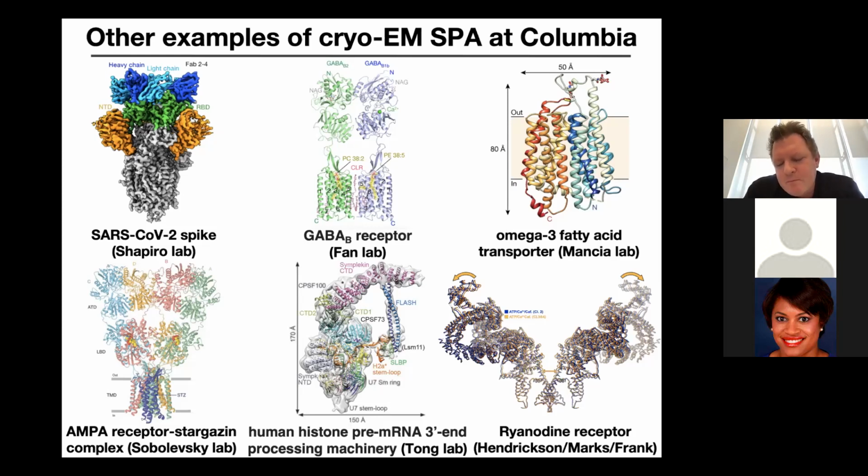Yeah. Okay. And we have a follow-up to that question. Do you think the laser phase plate offers the most benefit for single particle cryo-EM or in situ cryo-ET, or both?